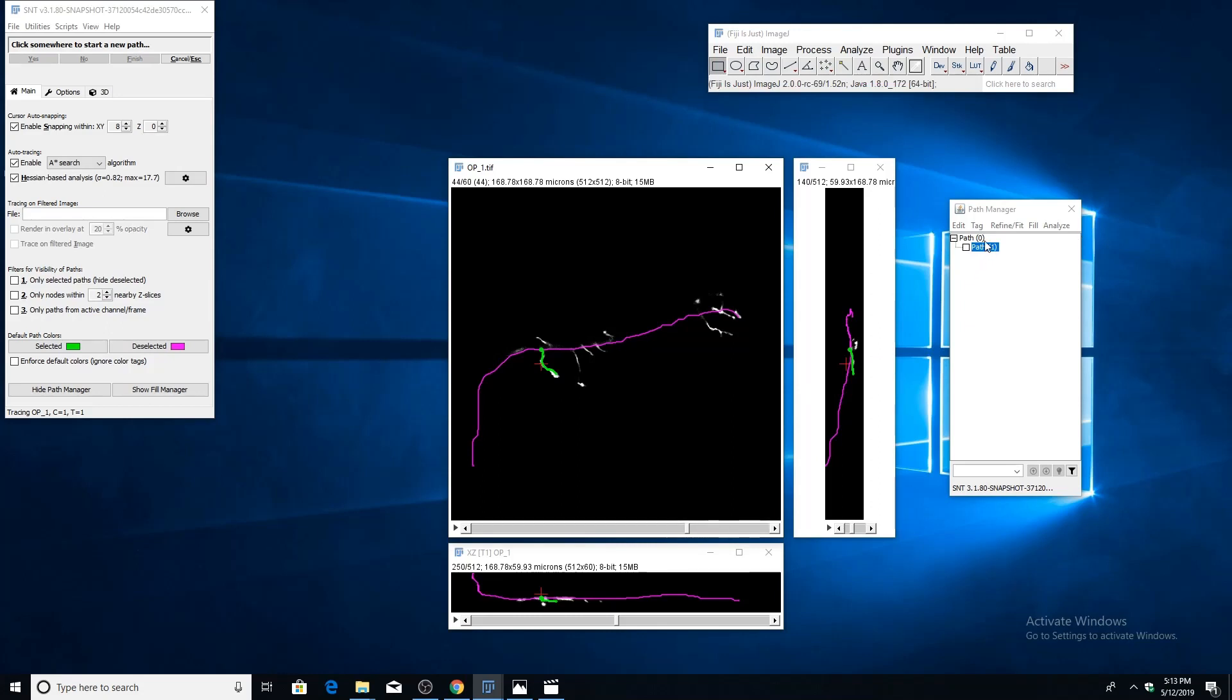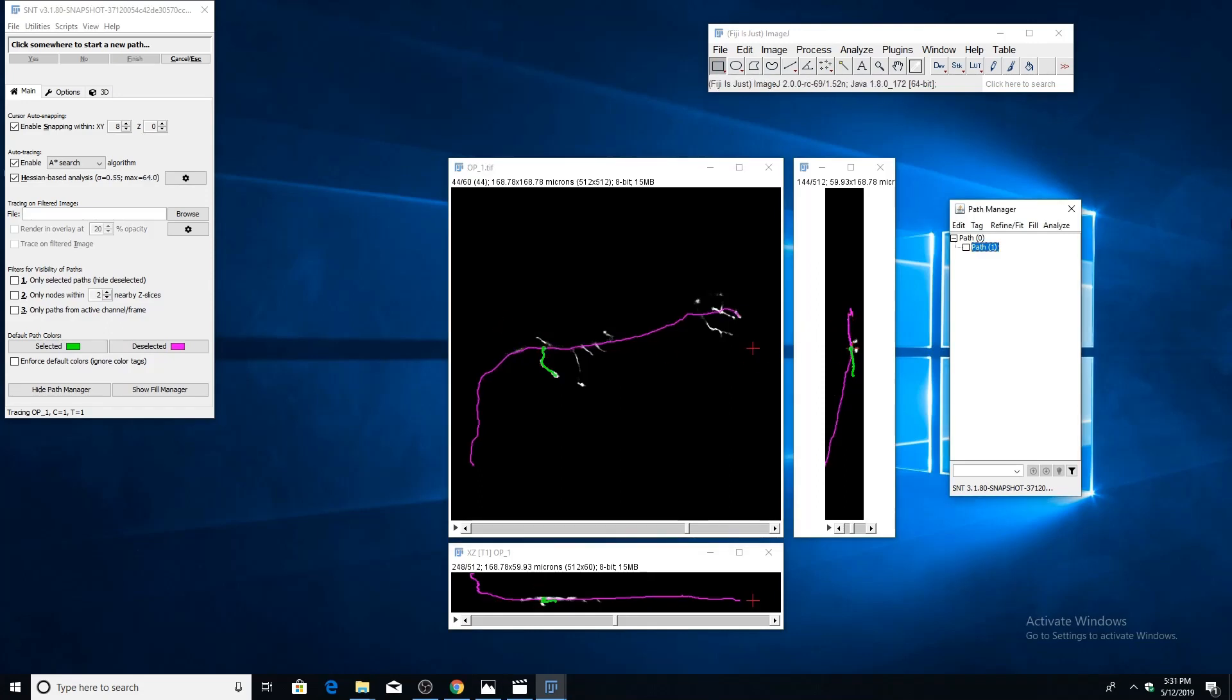You'll see that the path has been selected, added to the path manager, and that this new branch path is a child of the primary path. This is how the branching system works: the branch path will always be a child of the path where you created the fork point from.